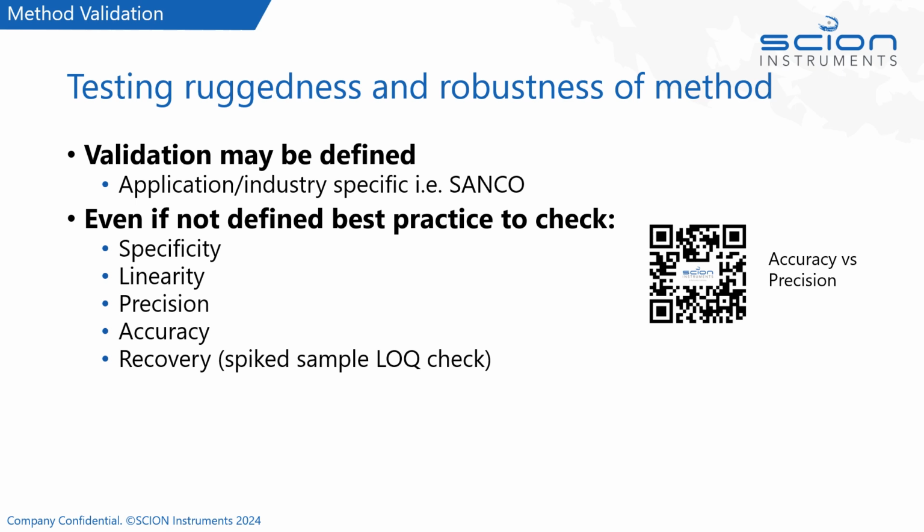Different guidance documents will provide different pass-fail criteria of this, and so something like Sanco is a useful document to use, even if you're not using it for this particular industry, but it's a useful guidance of whether your method is working well.